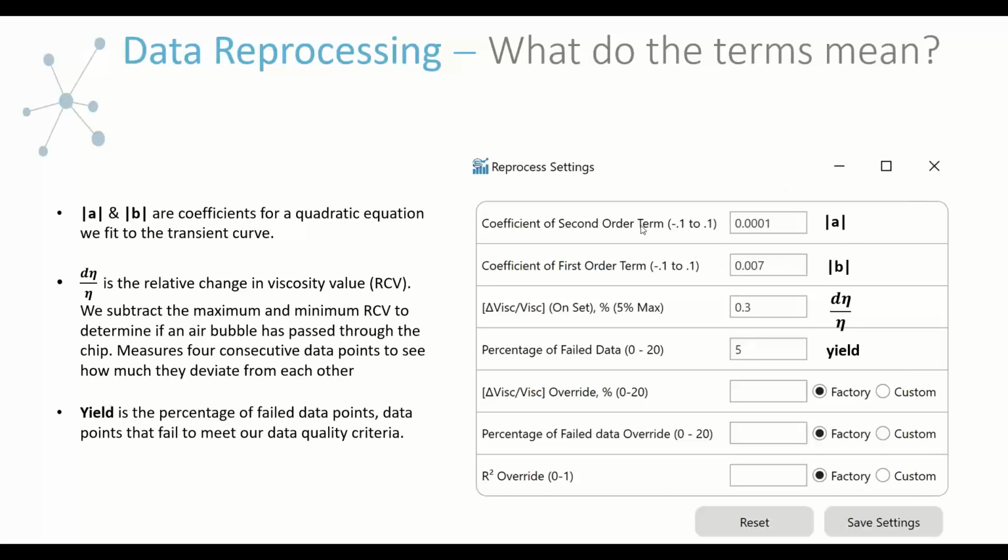So basically, if the steady state portion of the transient curve is not flat, for lack of a better term, if it starts rising dramatically later or decreases dramatically, Clariti will flag that as poor data quality with these 2 terms.